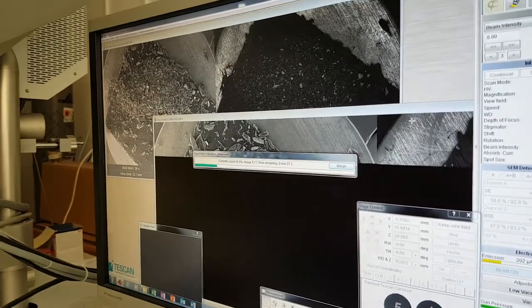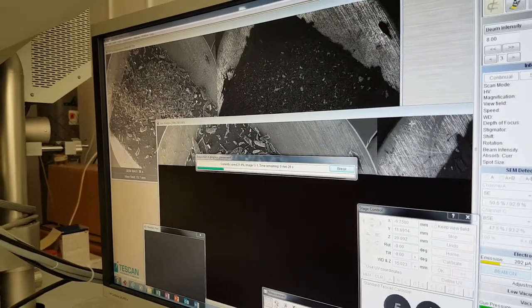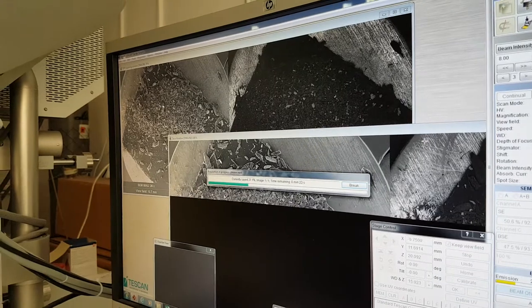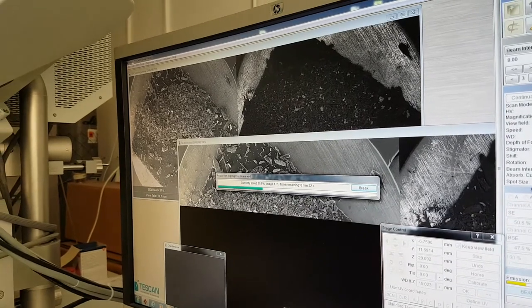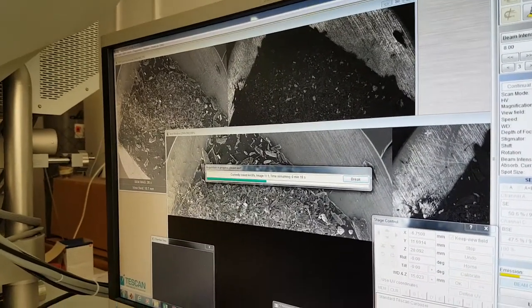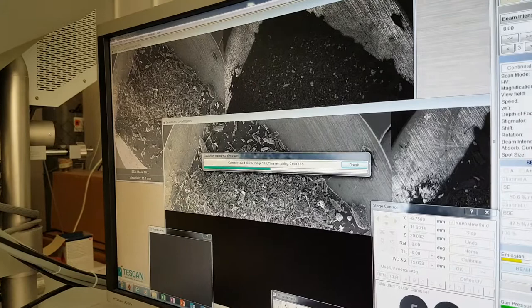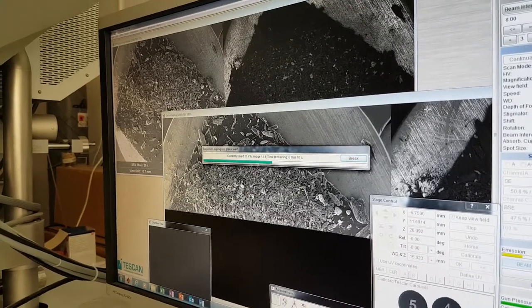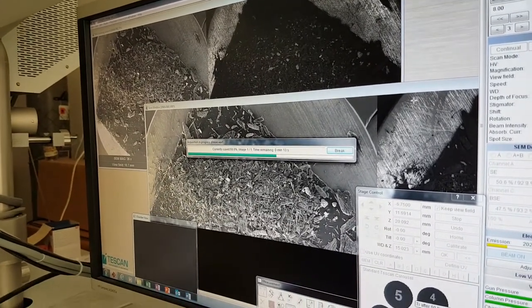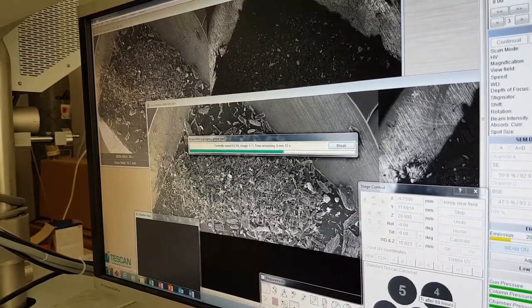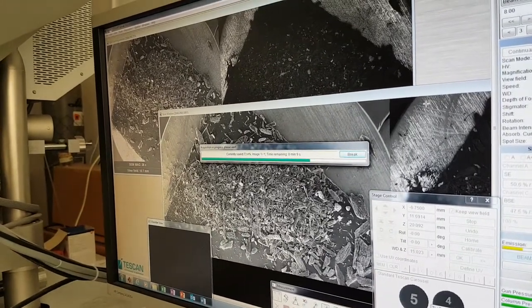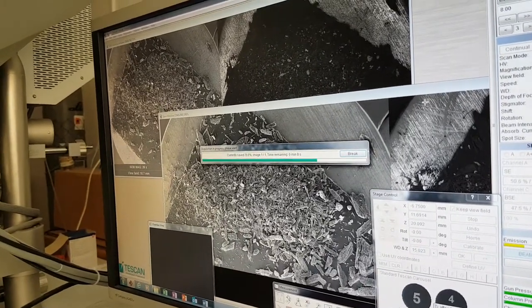Switching now to the second sample, which is the one that I extracted the magnetic particles from. So there may be metals in here, but I suspect there will not be iron in as high abundance as we saw in the previous sample.